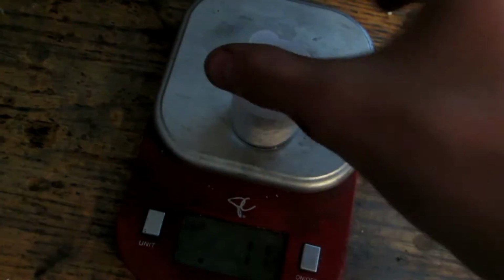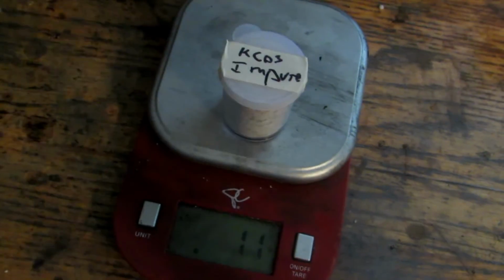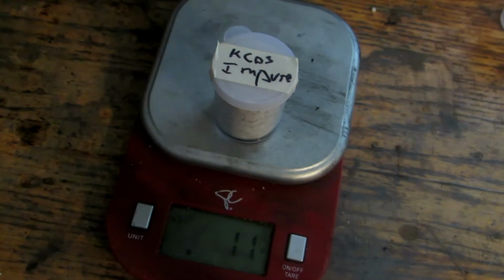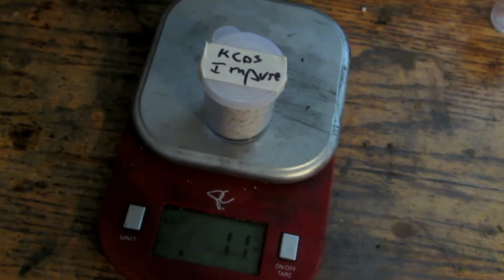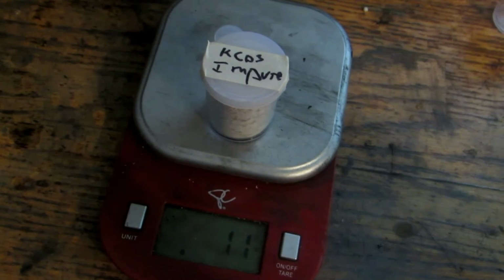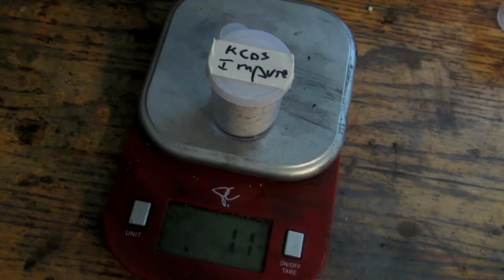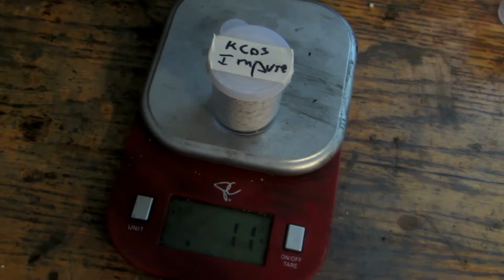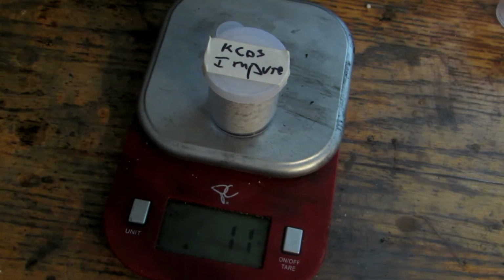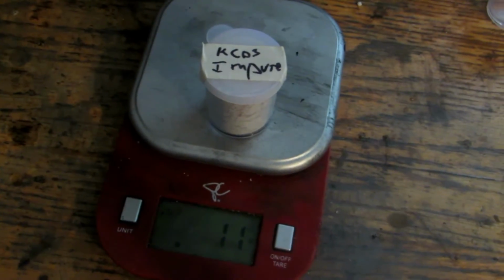So we have 11 grams here, and this is going to be decomposing potassium carbonate at high temperatures down to potassium oxide and carbon dioxide. Now this can only be done in something as hot as an arc furnace, which I made myself, and a blowtorch or something will not work. It will not get hot enough to decompose it. It has to be over 1,600 degrees Celsius, so very hot, as potassium carbonate is very difficult to decompose.